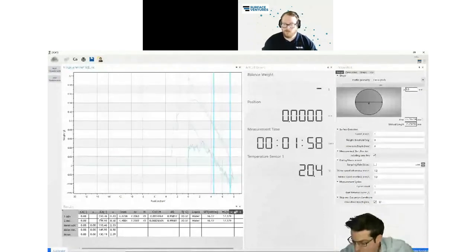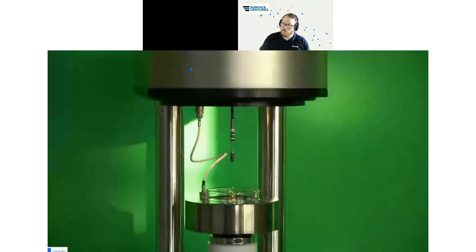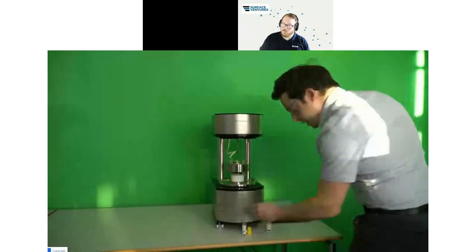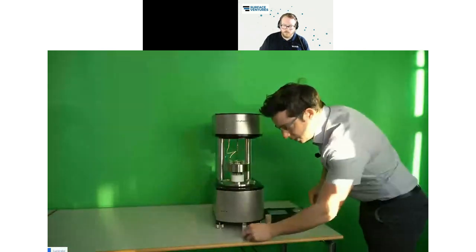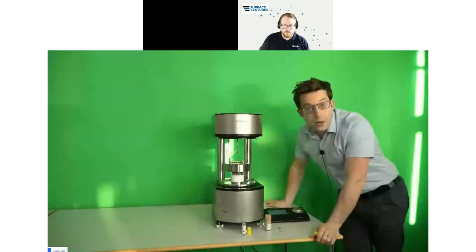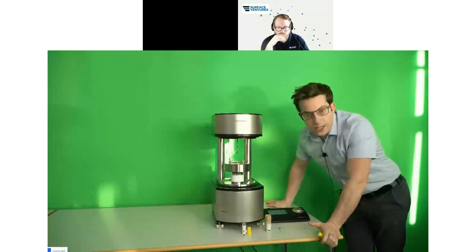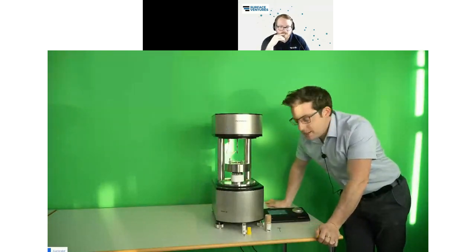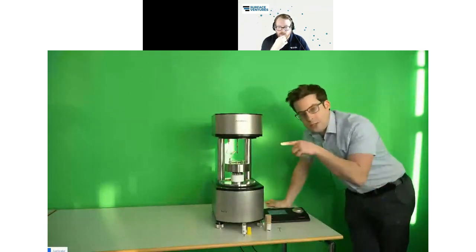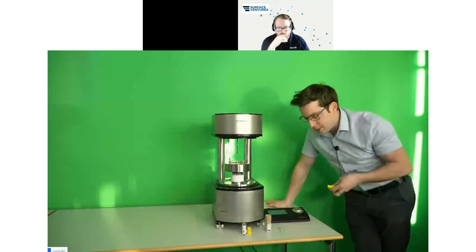You see here, I have prepared several other implants. So I zoom a bit out for you so that you can see them. I have prepared some other implants in this vial here, or here I have another little one lying on the table. If I would measure them, and they are also all hydrophilic implants, then for all of them I would get a contact angle of 0, and I would not know anything has happened on the surface. So this is really useful to have these imaginary contact angles to quantify hyperhydrophilic surfaces.